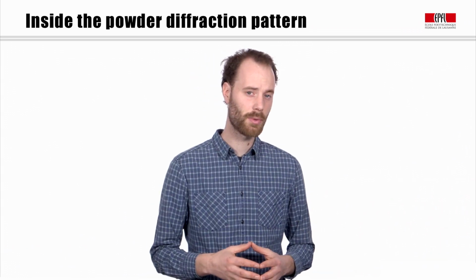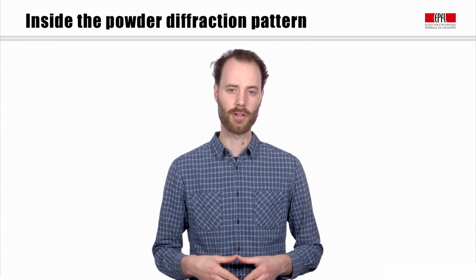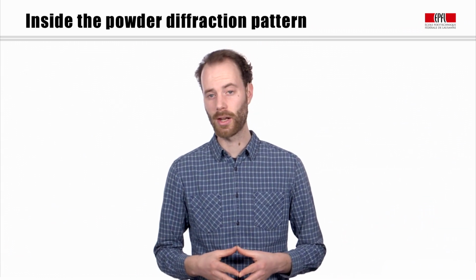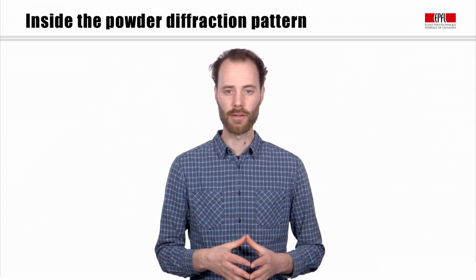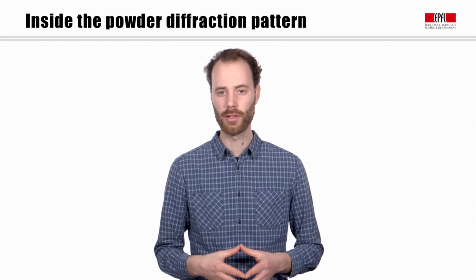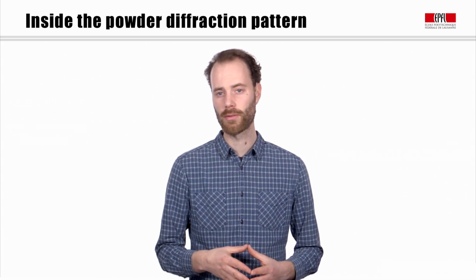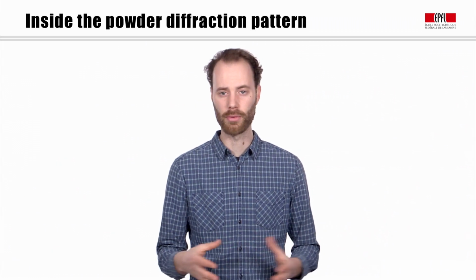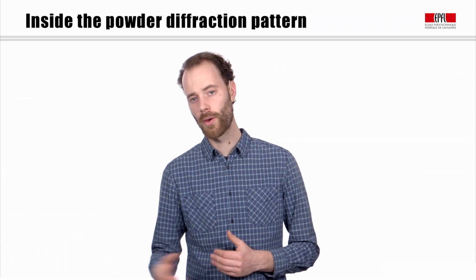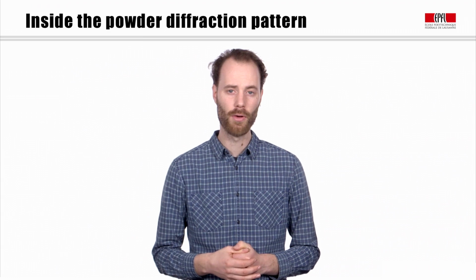In the next session, we will look at how we can best measure an X-ray diffraction pattern and then specifically apply it to cements. We will look at the diffraction geometry, the instrument, and then we will look at the best settings of your instrument to measure a Portland cement sample, for instance. Also, we will look at the best sample preparation procedure for your problem.